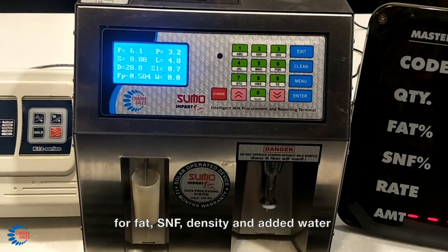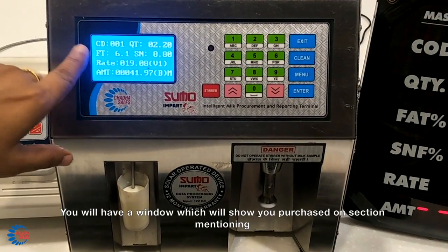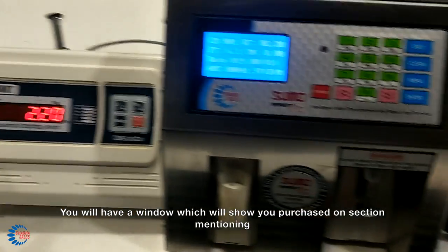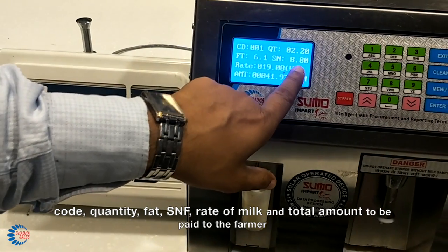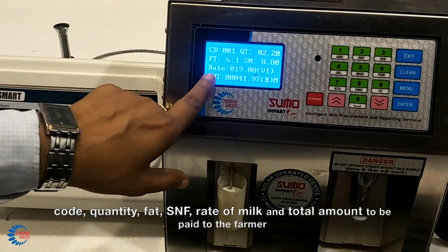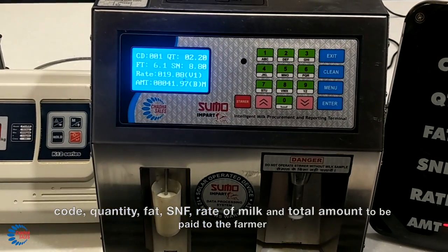density, and added water. You will have a window which will show you the purchase transaction, mentioning code, quantity, fat, SNF, rate of milk, and total amount to be paid to the farmer.